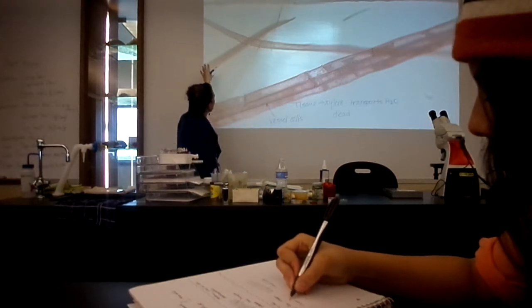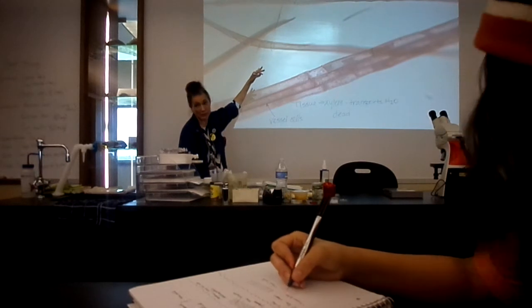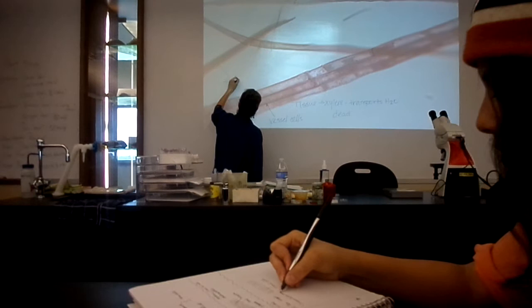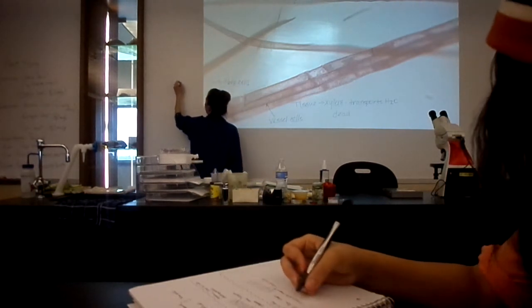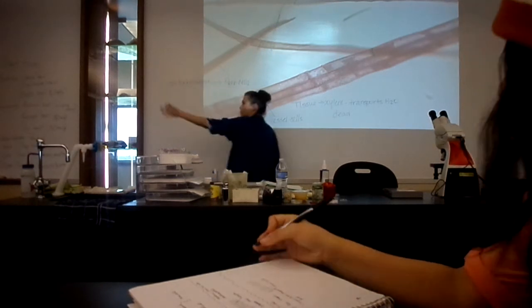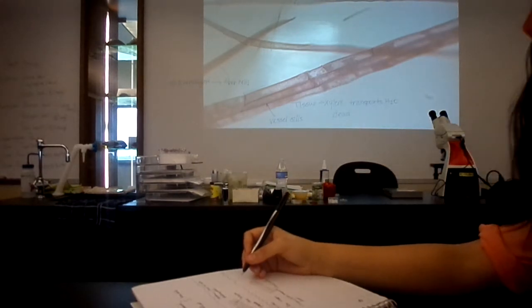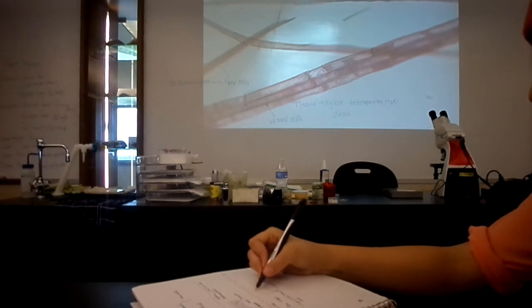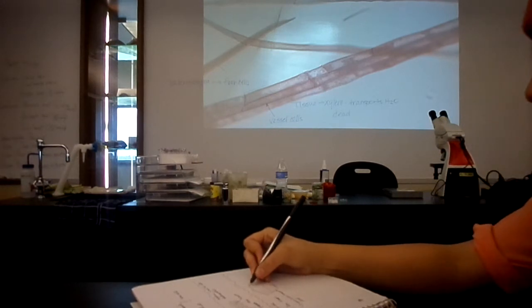Okay, this one is a good example because you can see the tip. The tip is tapered and a little more pointed. These are simply called fiber cells. The tissue is sclerenchyma. So look, sclerenchyma comes in two types of cells, stone cells and fiber cells. So it depends. So that's why they have a different name. So sclerenchyma is the tissue, and the cells can come in one of two types, fiber cells or stone cells.